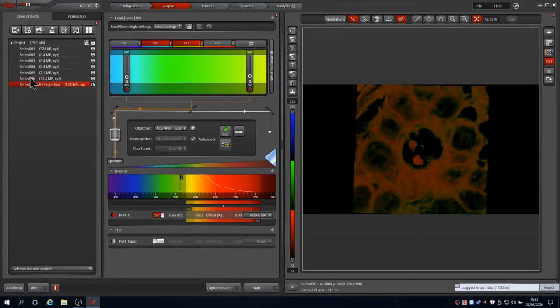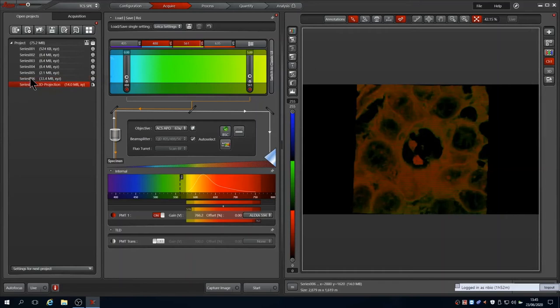LASX makes a project file each time you start. This is a Leica image file or LIF. It can contain multiple images, here we have the render, the RAW Z-Stack and the single plane images we captured before, all in one LIF project. Each RAW image also has all the associated metadata stored with it.